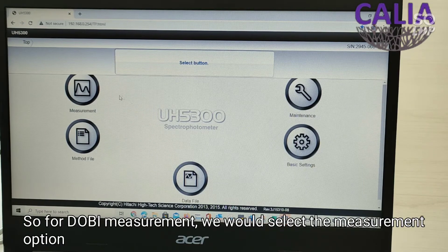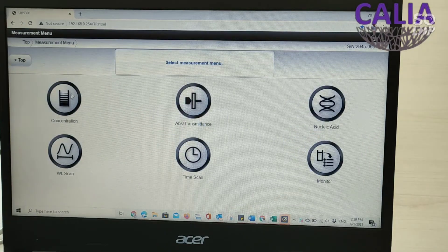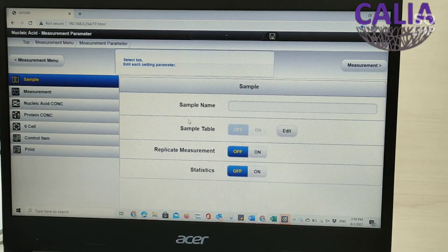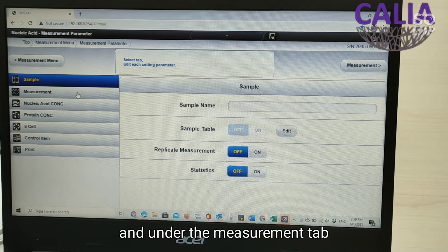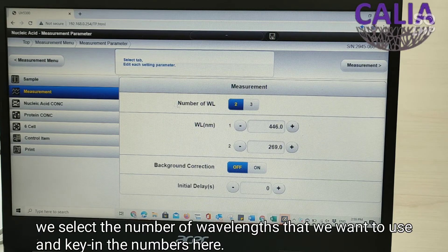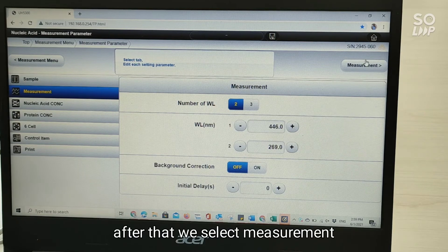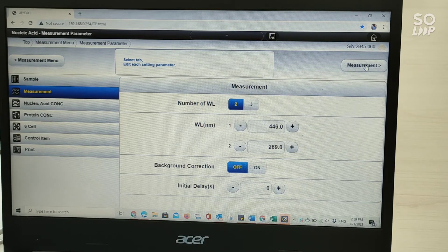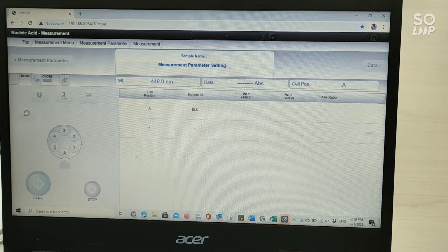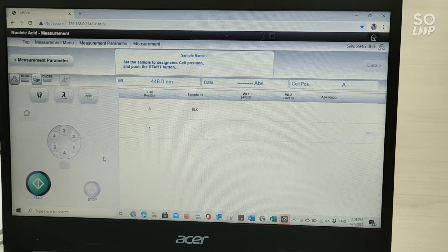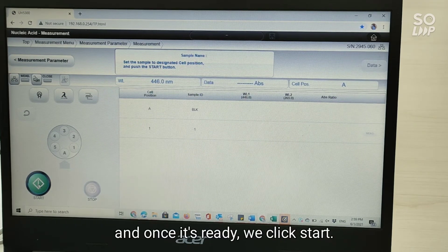For Dobie measurement we would select the measurement option followed by nucleic acid, and under the measurement tab we select the number of wavelengths that we want to use and key in the numbers here. After that we select measurement. Just wait for a few seconds and once it's ready we click start.